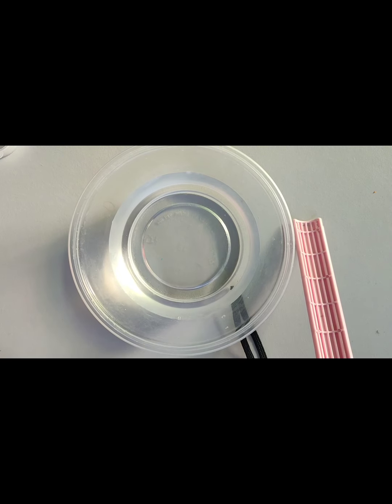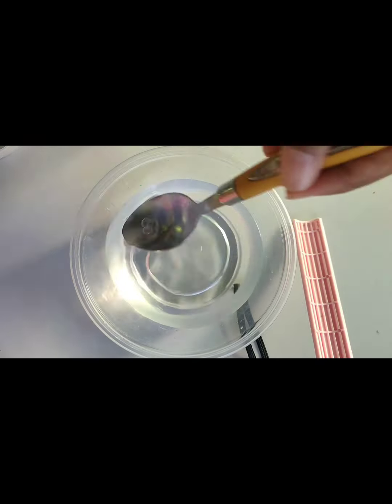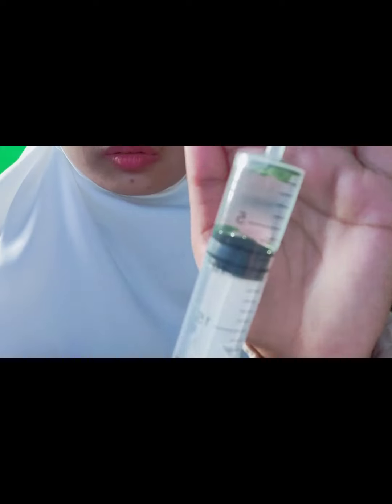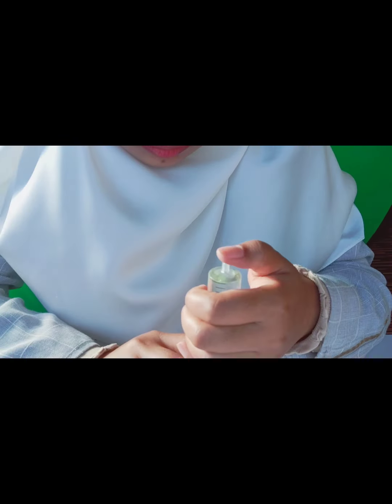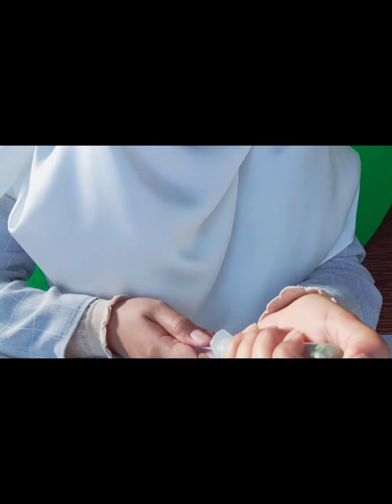And then we have plain water, and we put the sodium bicarbonate in the water and it becomes a solution of sodium bicarbonate. And then we draw about 6 to 8 ml of bicarbonate solution into the syringe. And then we remove the bubbles in the syringe. We hold the syringe with the tip up and expel the air gently by pushing the plunger until there is no air in the syringe.